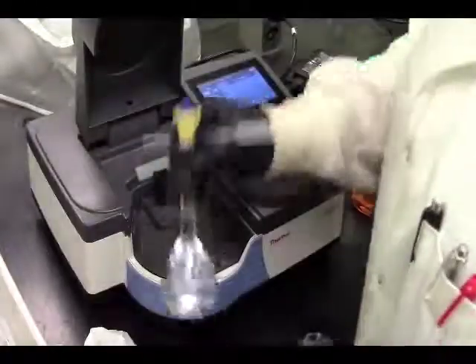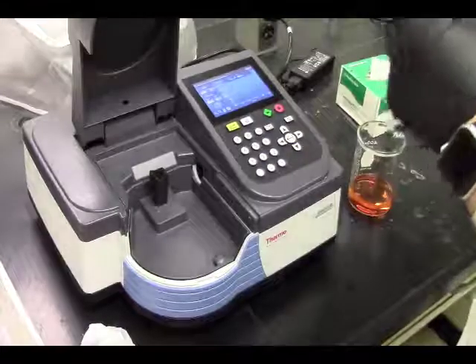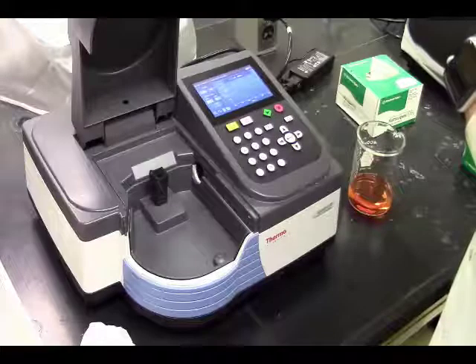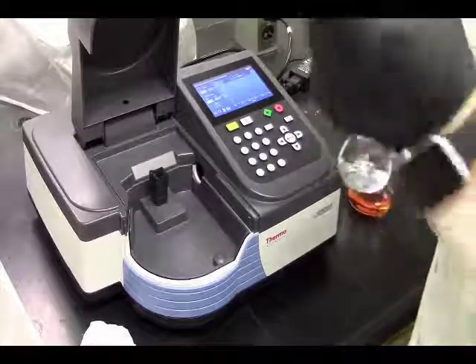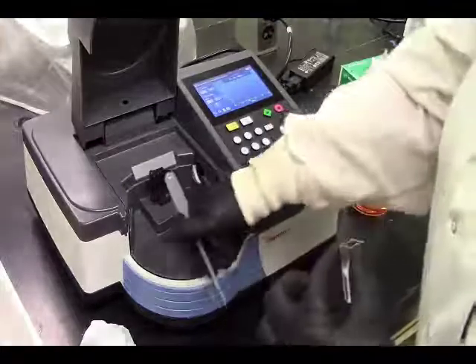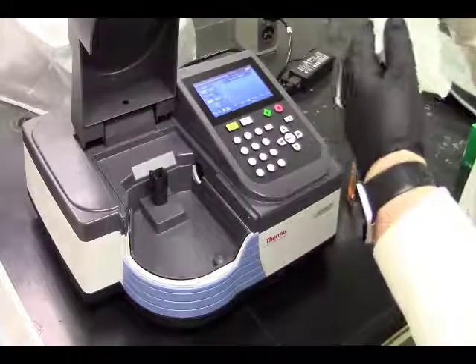Okay. The first thing we need to do is blank our instrument. So we have the blank that we made that has all of our stuff that's in the solution. Sorry, I hit the tripod. We're going to put a little in, rinse it around, dump it out into our waste. We're going to fill it to where the level of our liquid is in the pathway of our instrument. Otherwise, what's the use? Right?